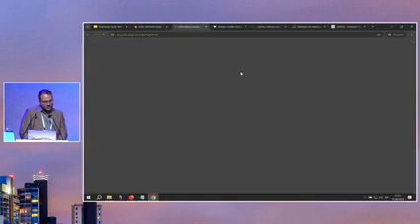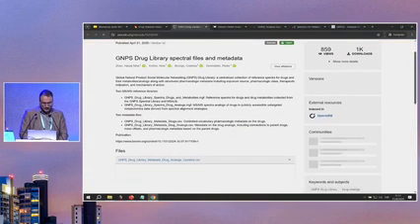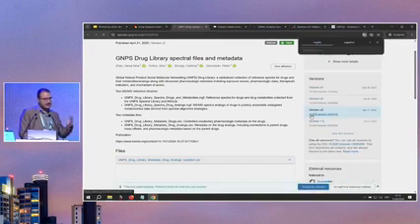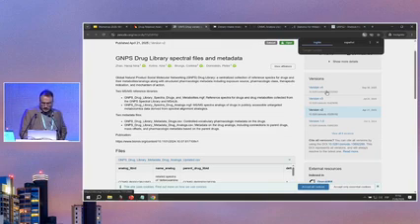I cannot present all the spectra right now, but if you go down there, you can see at least how it's classified. Right now you have 4 versions. Version 4 is the one that was used for the latest version of the publication, the paper that has been published in Nature Communications.